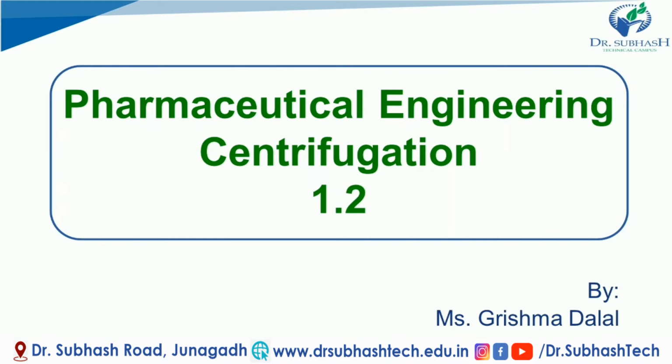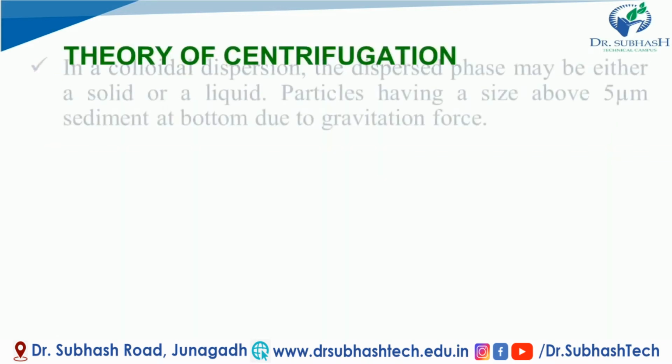This is the continuation of the last video, centrifugation 1.1, where we saw the basics of centrifugation. In this video we are going to focus on a slightly deeper topic, that is, what centrifugation is. You will get to know it in depth by studying the various theories that centrifugation depends on. What is the difference between centrifugation and gravitational force, and why is centrifugation so important in pharmaceutical engineering and in all the experiments that you perform? So here is the theory of centrifugation.